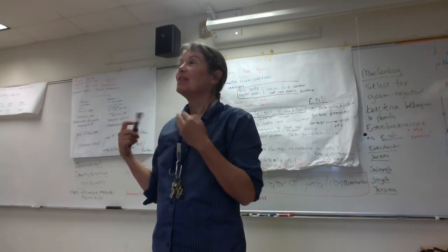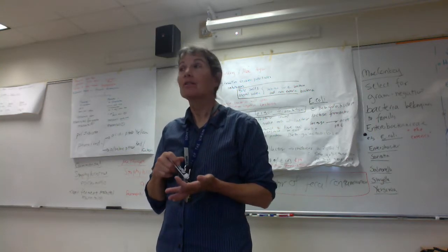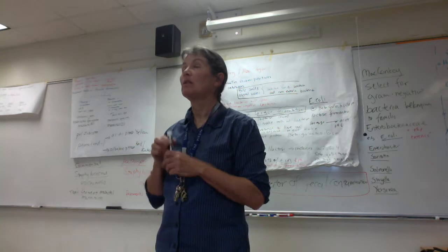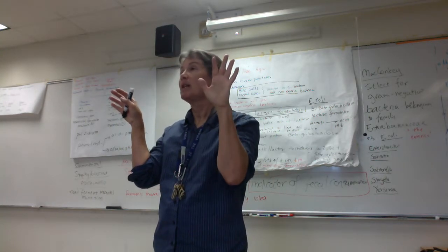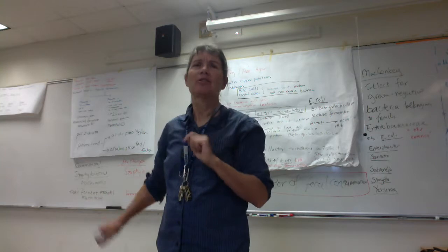Yeah. So we could say E. coli is kind of unusual in that it makes beta-galactosidase, right? It can use lactose as a carbon and energy source. So with MacConkey's, you guys, we're going to use lactose fermentation as our way to differentiate two big groups of the enterics: the lactose fermenting bacteria, which includes E. coli, and the lactose non-fermenting bacteria, which includes Salmonella, Shigella, and Yersinia, okay?